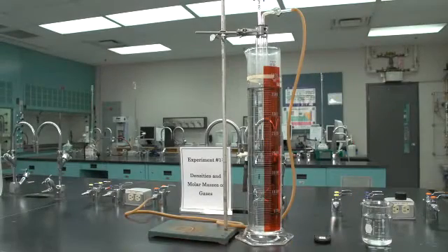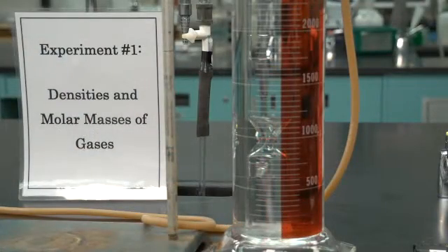The purpose of this experiment is to determine the molar mass and densities of a variety of gases using the effusion technique.